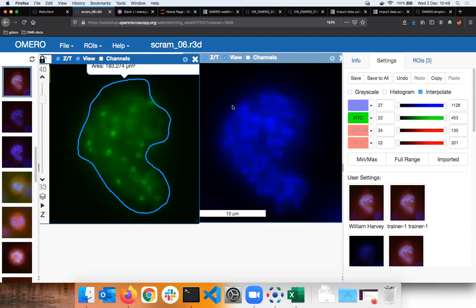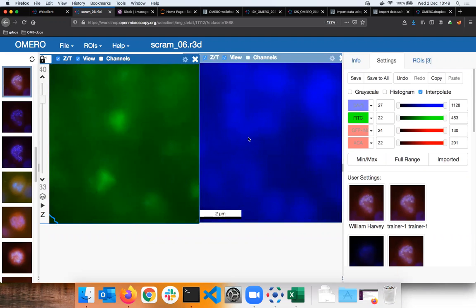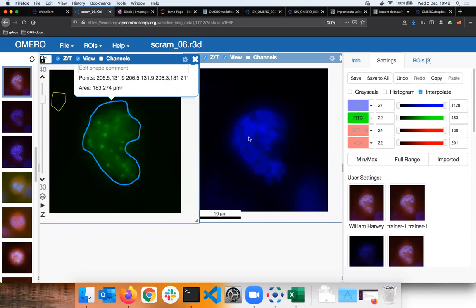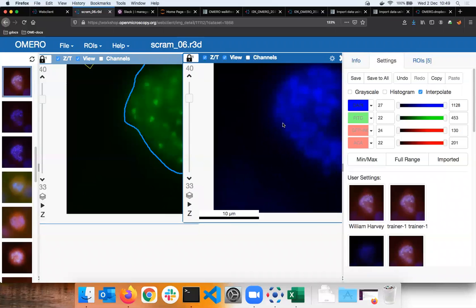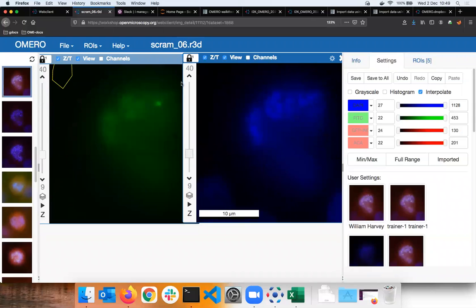And if I do it in both channels, I can now verify that if I do the first action, they are synchronized now. So I'm scrolling my mouse wheel, and this zooms them in and out in sync, as well as if I move them, that's in sync. And if I change the Z plane here with the slider, then the two are in sync as well. You can see that they are working in sync. And what is synchronized is highlighted here with the blue check boxes.